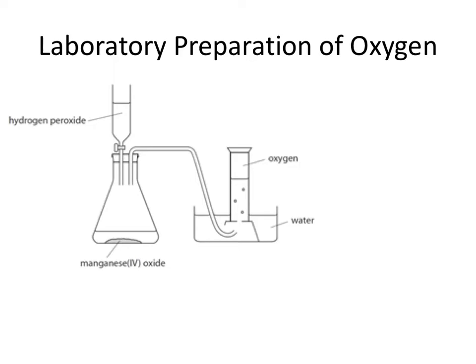This is the kind of setup we're going to use. Here we've got a conical flask and a delivery tube which is going to deliver our oxygen gas into an upturned measuring cylinder or boiling tube. That boiling tube was previously completely filled with water, and as the oxygen bubbles in, the water is pushed out.